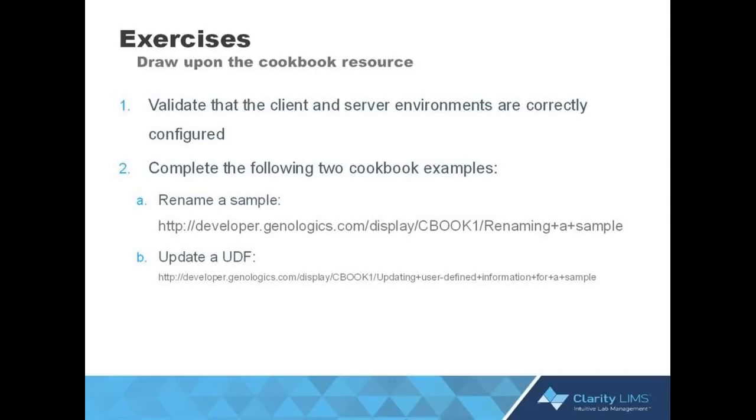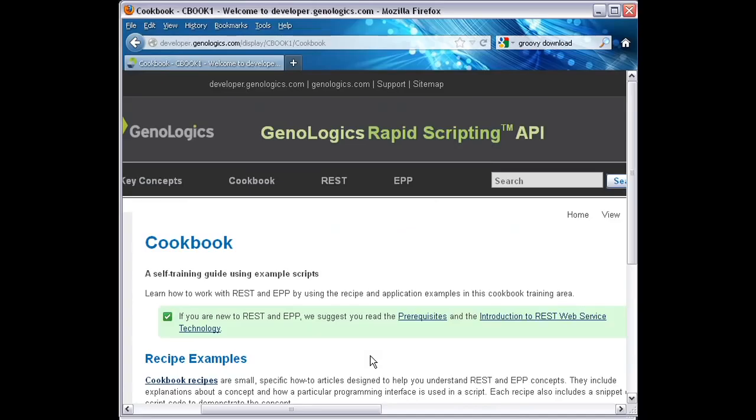Hello, in this recording I want to go through the first of the exercises which have been assigned for Module 3, which is using Groovy and applying the cookbook scripts. So let's start by getting the cookbook script that we want. Just as a reminder, here is the exercise. And we want the renaming the sample script.